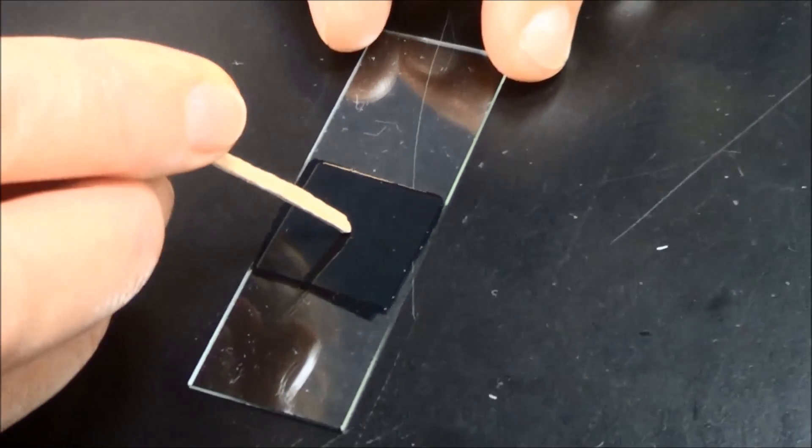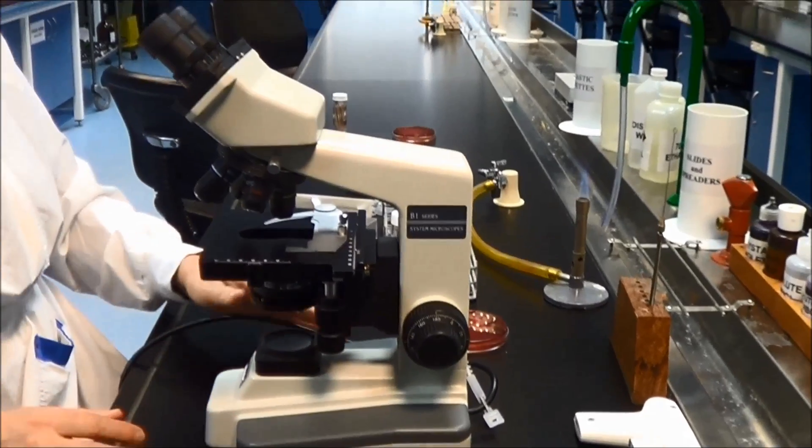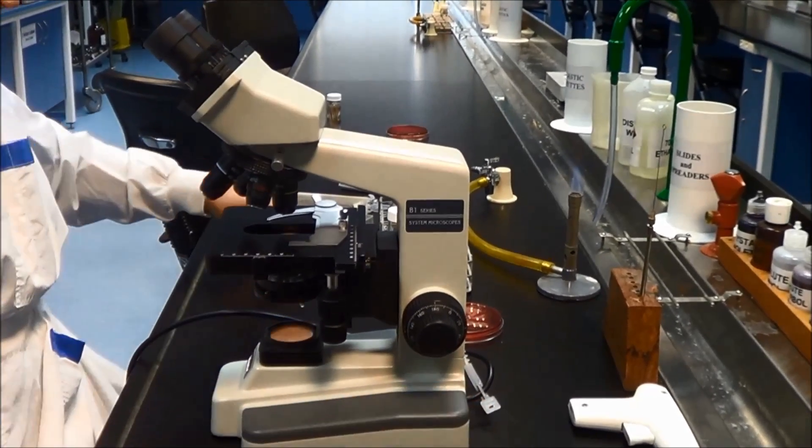Examine the stained wet mount by standard brightfield light microscopy. Start with the 10× objective and ensure the condenser is raised.